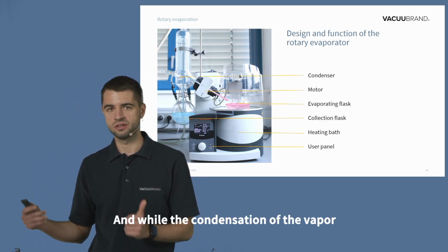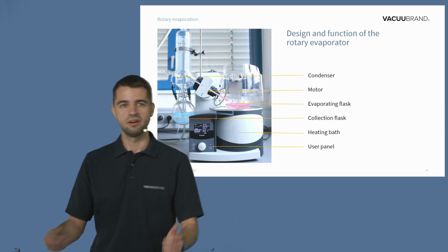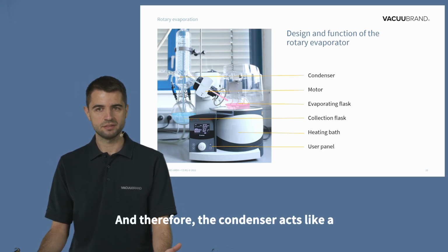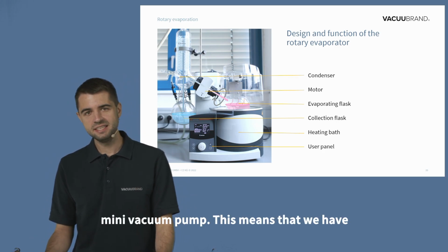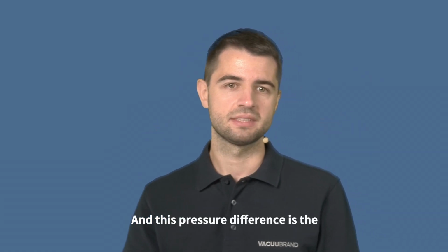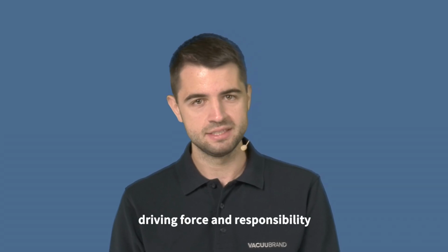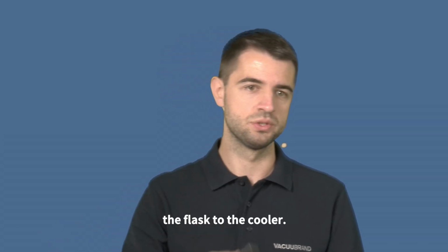While the condensation of the vapor in the glass cooler, so on the blue side, on the other hand, creates a negative pressure there. And therefore, the condenser acts like a mini vacuum pump. This means that we have a pressure difference created between evaporation and condensation, and this pressure difference is the driving force and responsible for the vapor transport from the flask to the cooler.